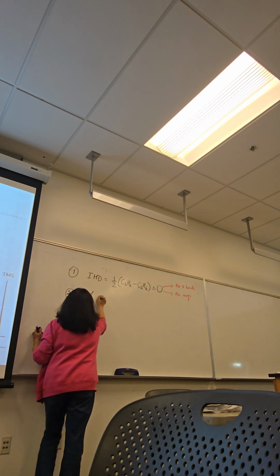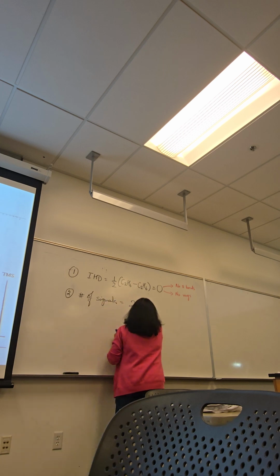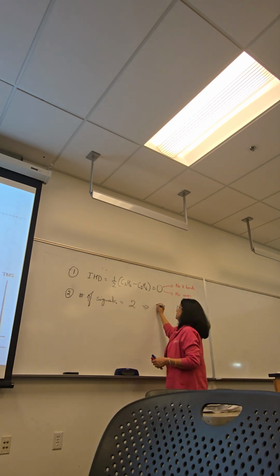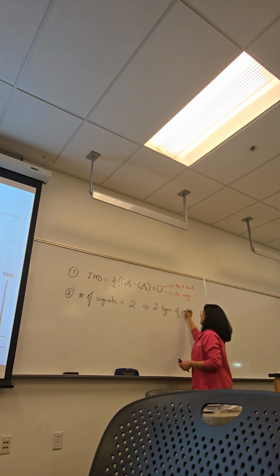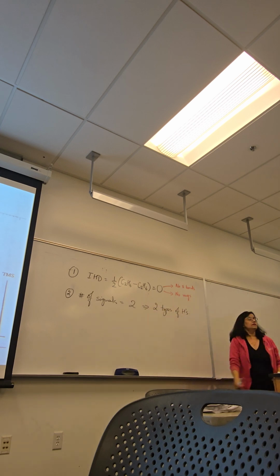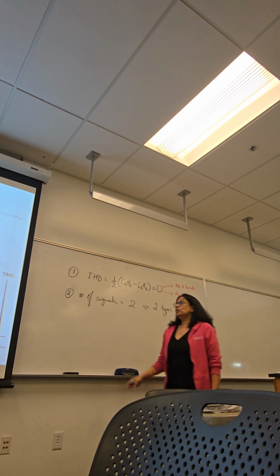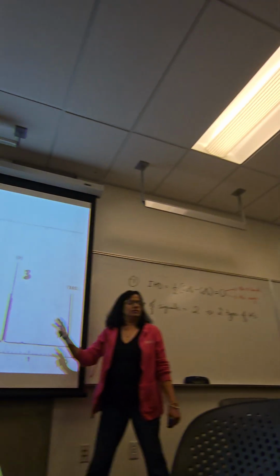How many? So what does that tell us? What does that mean? If there are two signals, there are two types of hydrogens. Two types of H's in the molecule. We good? Yep. I'm just going to call this A, that's B, it's already labeled.